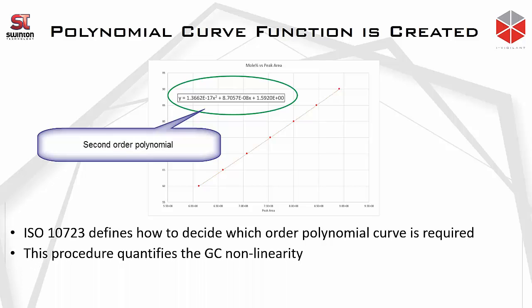Now, when we do this, we quantify the nonlinearity of the GC. So basically, we create a true function of the GC performance itself. So that covers the nonlinearity part.